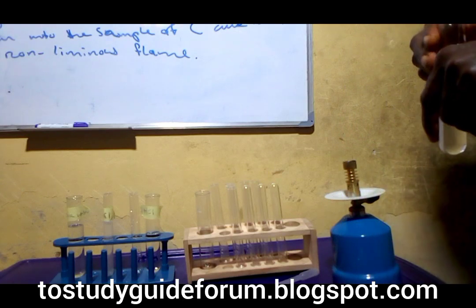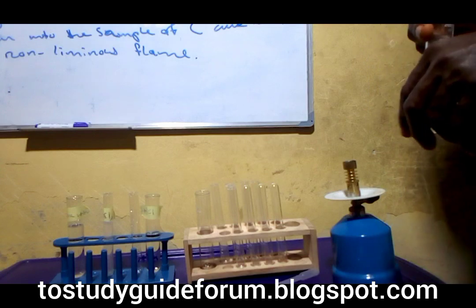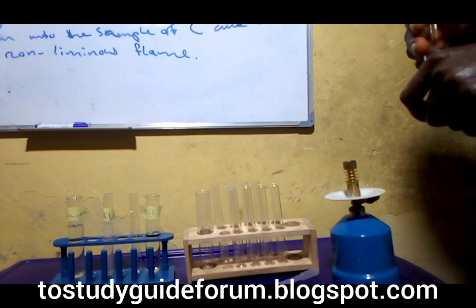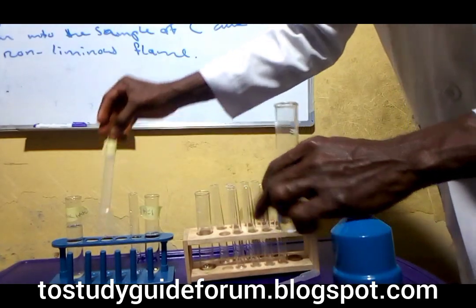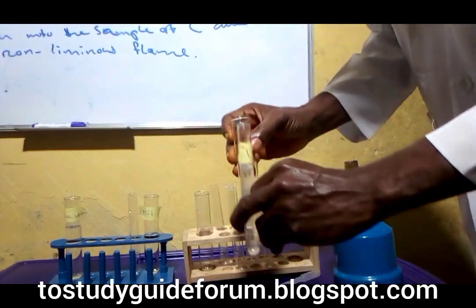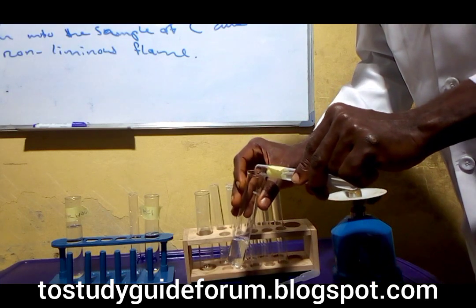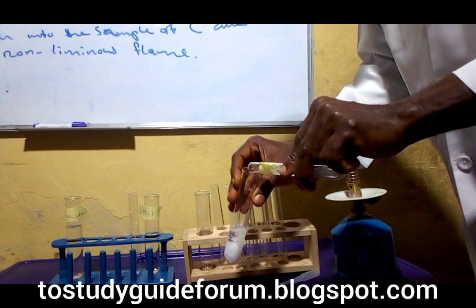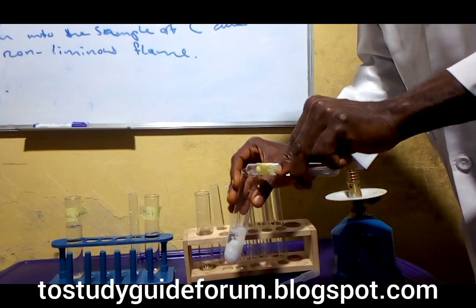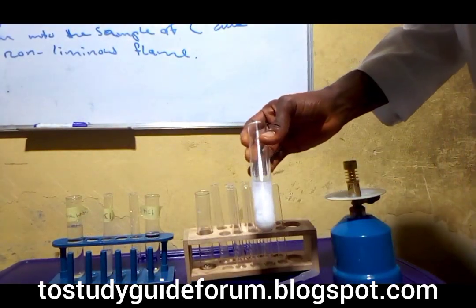So the next test the question said we should do is to add the barium chloride solution. We have barium chloride here. We add the barium chloride into it. By adding barium chloride, it gives us a white precipitate.